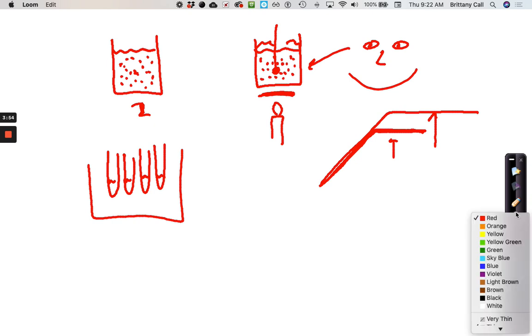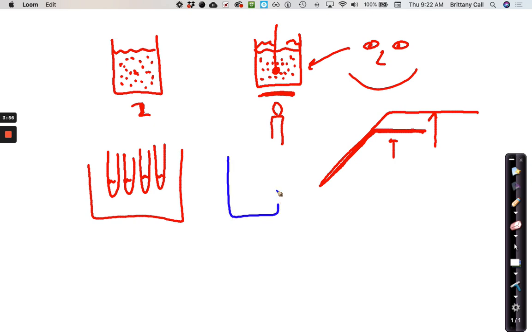So you're going to grab a medium beaker. You're going to fill it up so it's got 150 milliliters of water, and then you're going to add 2 boiling chips. Will you underline boiling chips? Boiling chips are new to us. We haven't used boiling chips. What they are is they're just little pieces of marble, okay? They're little chips of marble.